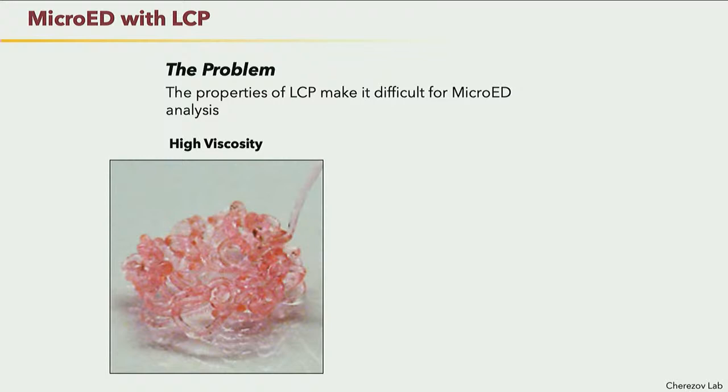You have to blot most of your liquid away because the benefit of the electron beam is it interacts with matter very strongly. The negative of the electron beam is that it interacts with matter very strongly, which means when your sample gets thick, you can't see through it anymore. So you have to blot away most of your sample.